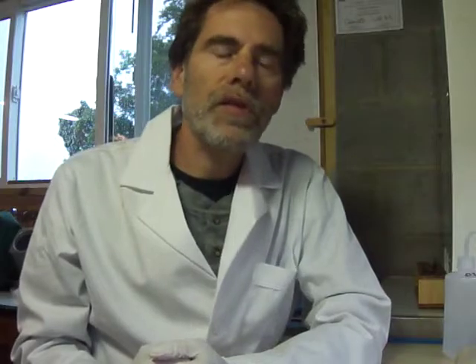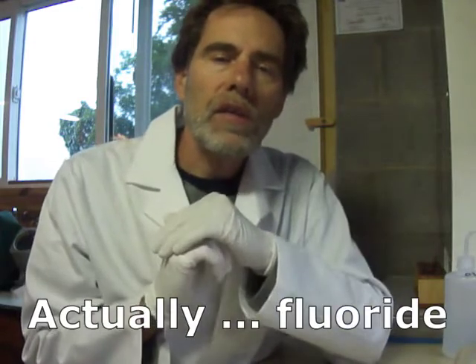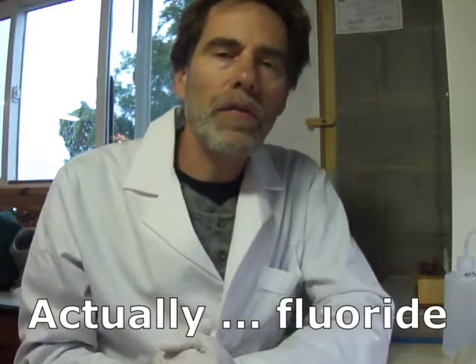A couple sources suggest taking some of the powdered material and adding about four or five times the volume of sodium metaphosphate to it, mixing it together, putting it into the bottom of a closed tube and heating it. If it's fluorite or if there's fluorine in the mineral, you'll get some hydrofluoric acid coming off and it should etch the inside of the tube, and you'll also get some silica deposited in the tube. So those two will indicate that you do have fluorine in there.